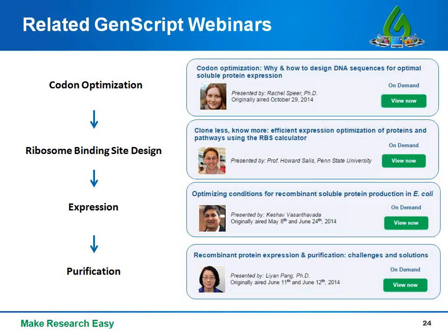I'm going to talk briefly in the following slides about codon optimization and about ribosome binding site design. And I would enthusiastically encourage you to check out the webinars by my colleagues on optimizing conditions for soluble protein production and on overcoming some challenges for protein expression and purification.